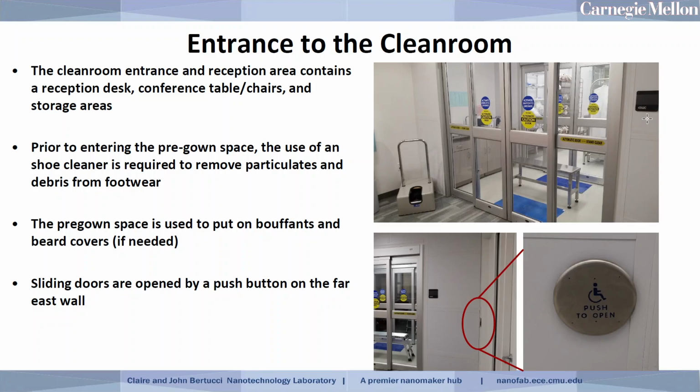All of the sliding doors to enter the clean room are activated with a push button on the wall. So in this case, when you're standing here in the lounge, directly on the right there is a button that you can push that will cause these doors to open. Now is probably a good time to explain how those doors work.